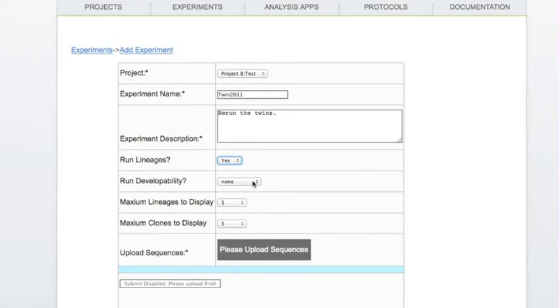Asked, do I want to run developability? This is asking would I want to turn any of those antibodies into a drug. I don't, but for the purpose of the demonstration, let's just include it so we can perform additional analysis of features that might be relevant for drug development. It'll tell us some interesting things about N-linked glycosylation, acid hydrolysis, deamidation sites, and germlining of framework residues.